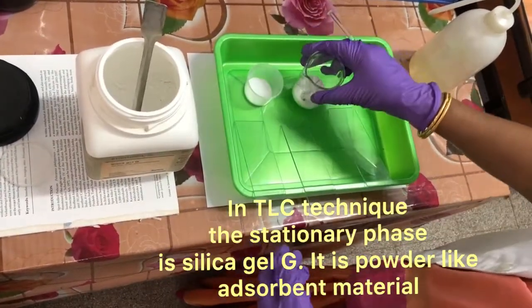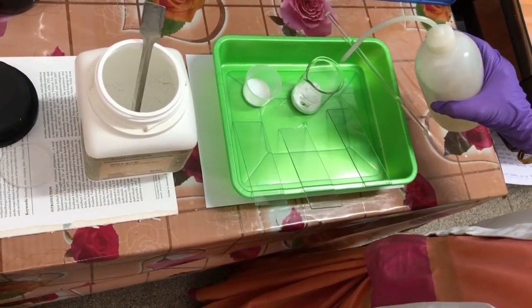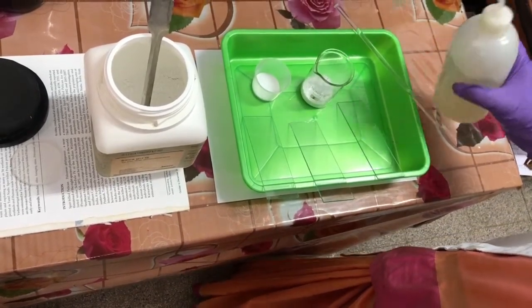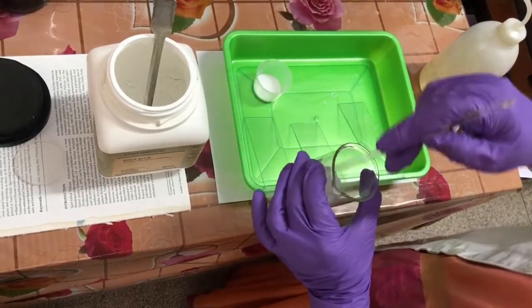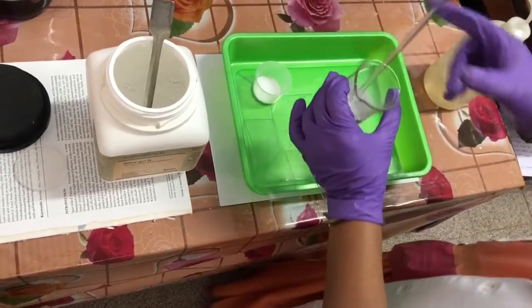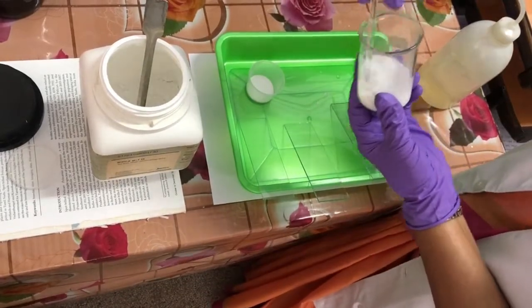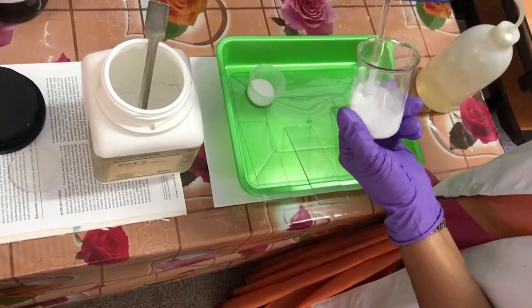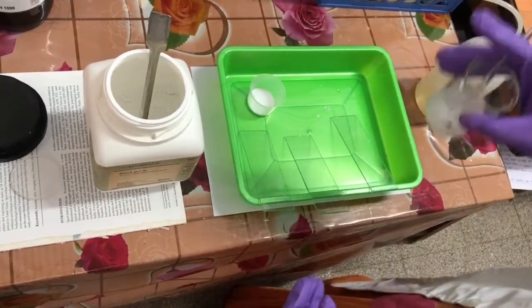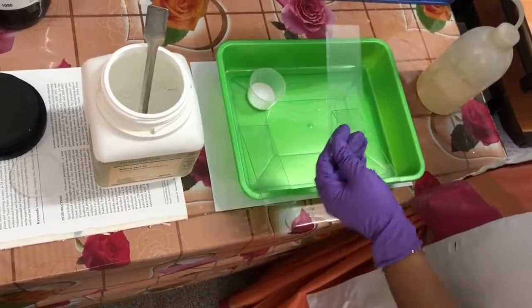Now I am going to coat this plate with the silica gel paste. You have to make a paste like batter — like your dosa mix. Mix it with small amounts of water like this. You make it like a dosa batter, and then you pour it on the plate.